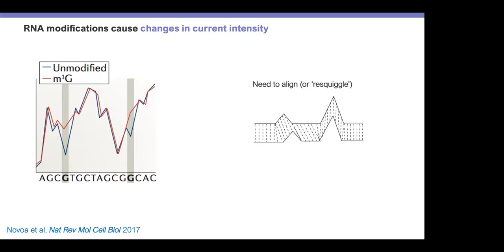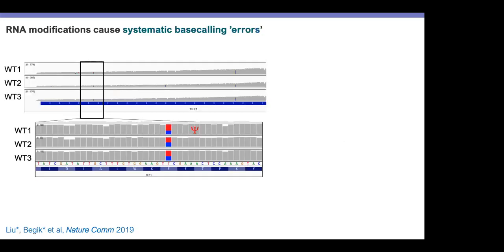And this process actually relies on the base call to guide the decisions. Otherwise, it would be a mess. In the very early times, back in 2017, the base calling accuracy was super low for RNA. And therefore, when you use the base calls to guide this, it was a disaster. So back then we were trying that and it wasn't working. So we decided to come to a different solution.